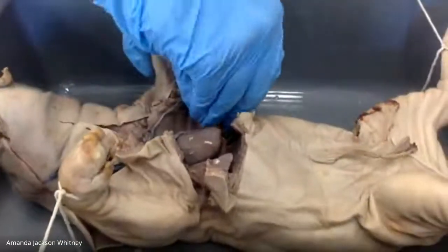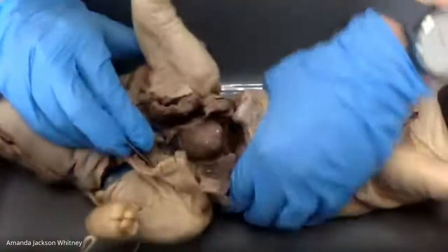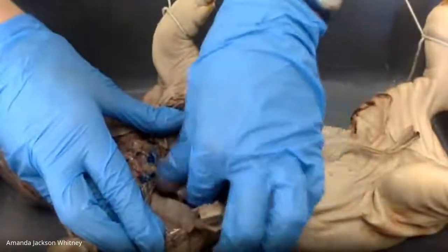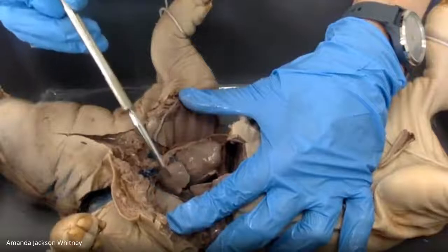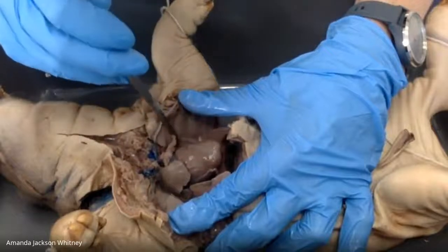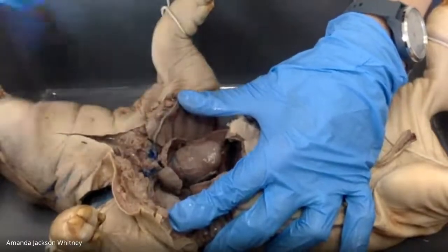And the lungs are one of the things that students are always like, what? I had no idea that they look like that. And they don't look very big from the anterior angle. And in just a second, when I take them out, you'll be able to see that they are quite a bit larger than this. But the lungs are all of this surrounding tissue right here. These are the different lobes of the lungs. Pigs have a different number of lobes than we do in their lungs. But here's the heart and then all of the lungs surrounding here, okay?